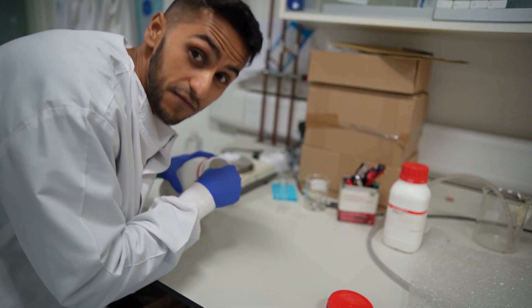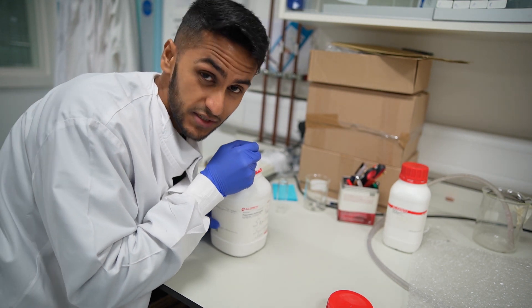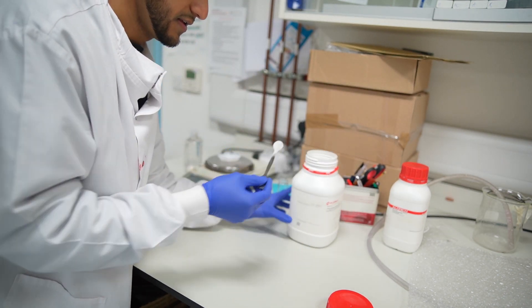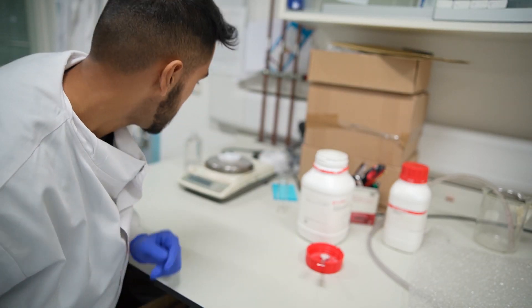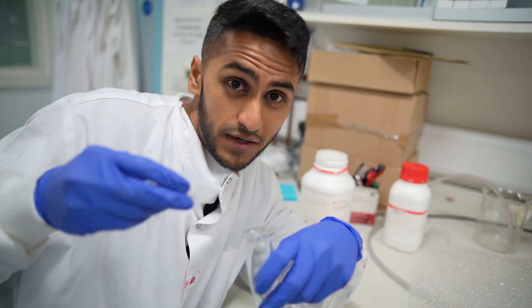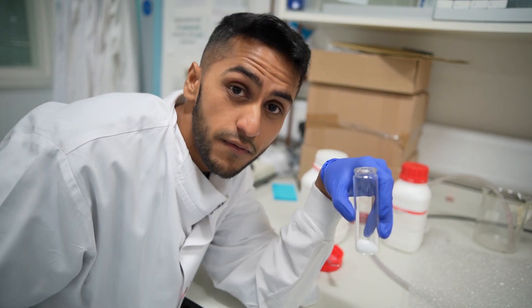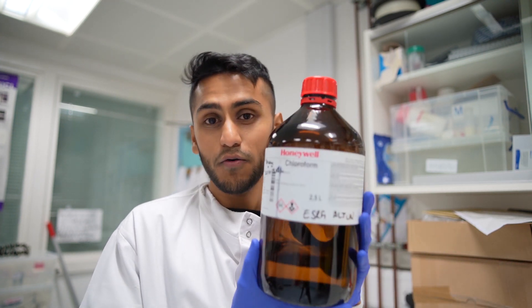That was very messy, sorry. Obviously as a PhD student I'm very accurate, but right now because I'm filming it's not ideal — but it's actually exactly 2 grams. So I'm going to pour the 2 grams into this vial and add 10 millilitres of the solvent. The solvent we're going to use to dissolve this polymer — which is polymethyl methacrylate, PMMA, basically acrylic — is chloroform, to dissolve the PMMA and make it into a polymer solution.